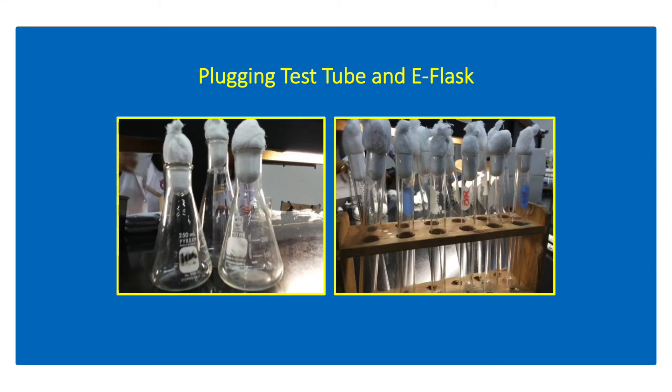Plugging is done to avoid contamination of the media in test tubes and E-flasks after autoclaving. Cotton and gauze are used for plugging because it allows sterile air to enter the media for aerobic culture requirement, consequently preventing any other unwanted microorganisms from contaminating the culture media.